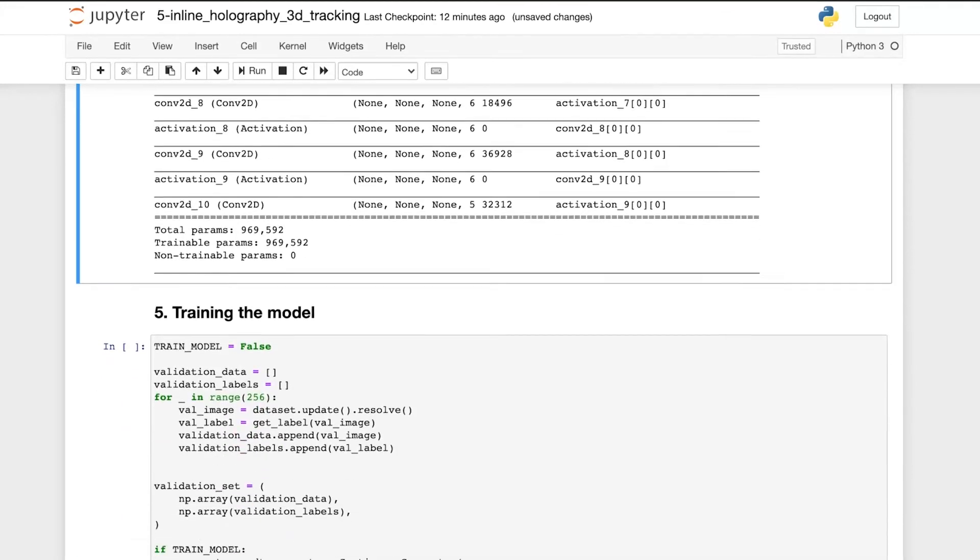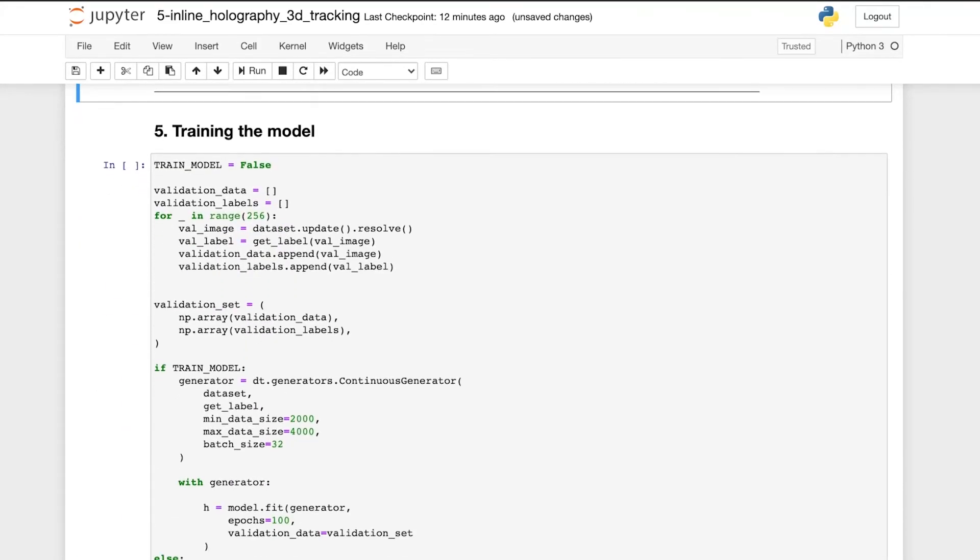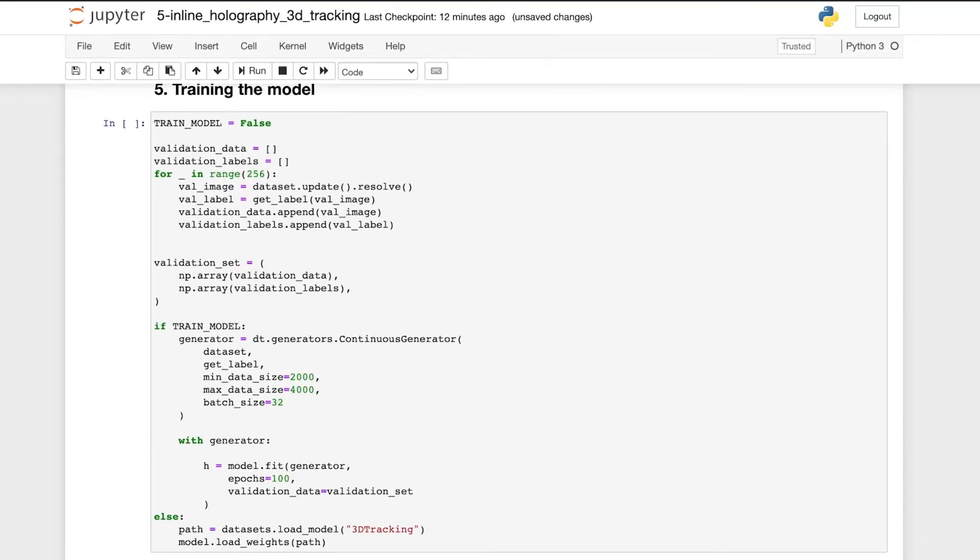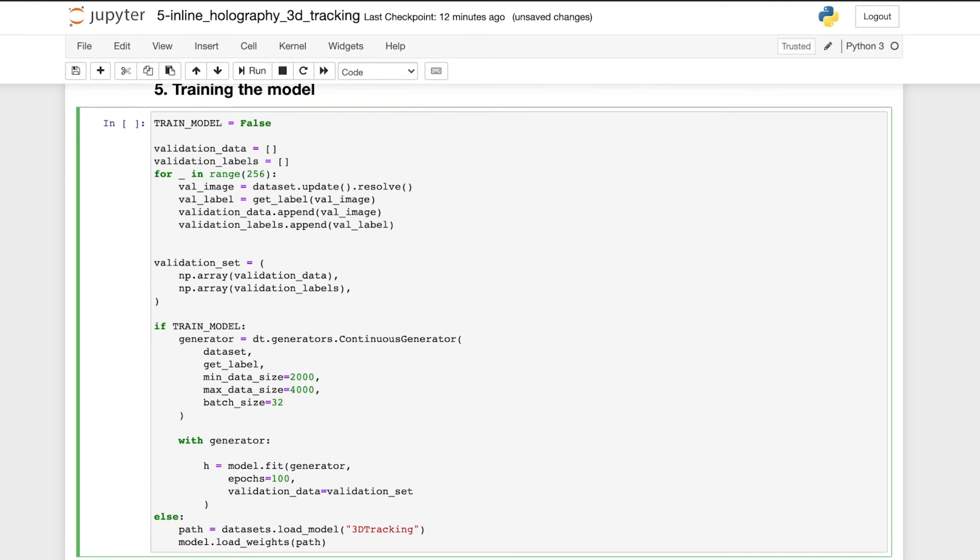And now for the training of the network. If we keep train model as false, we load a pre-trained network that we have available for this problem. But if we want to train a new model, we change train model to true.